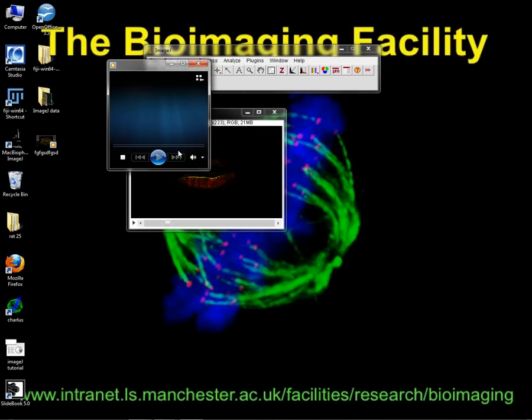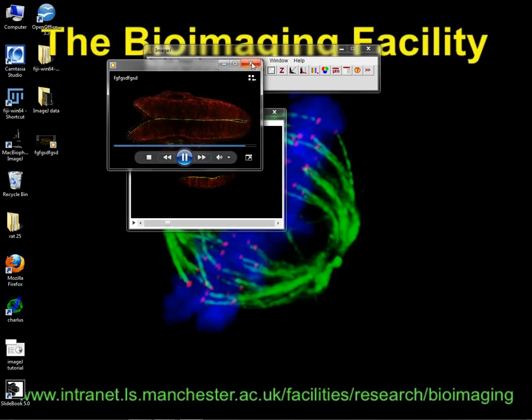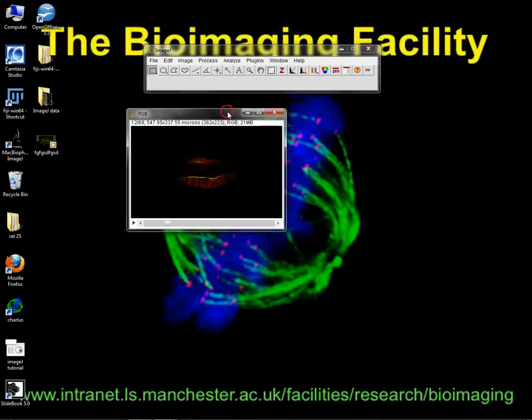There you go. An AVI that you can put into your PowerPoint. Yeah, so it's all doable. I mean, this is the beauty of ImageJ.